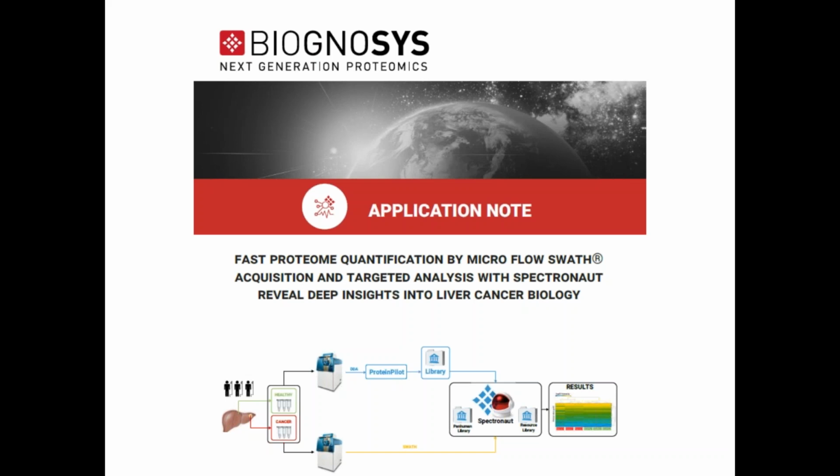Good. The next question is about the overall quantification mentioned for the DDA library. Here, what I wanted to say is that the overall quantification is the cumulative number of peptide precursors and protein groups identified, meaning that every peptide precursor and every protein group that is identified at least once is counted here. Because for the quantification we want to focus on the more reproducible peptide precursors, we use the sparse percentile filter, and then did the t-test only on that.